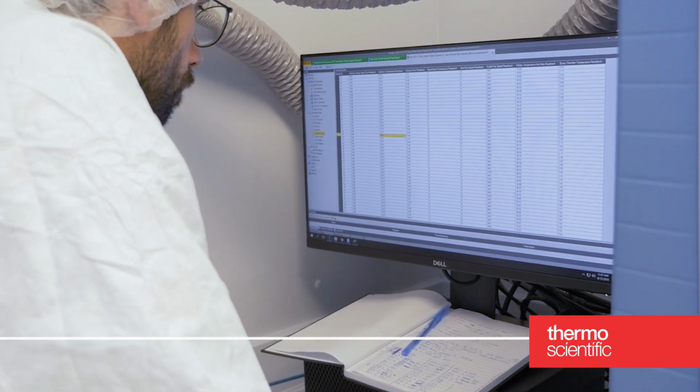As a preferred vendor for ICP-MS system, the important part of it is, first of all, having a high-quality instrument, but on top of that, being able to have a technician who knows our instrument come in, do a repair, answer questions either via email or telephone in order to assess any of the issues that we might be having.